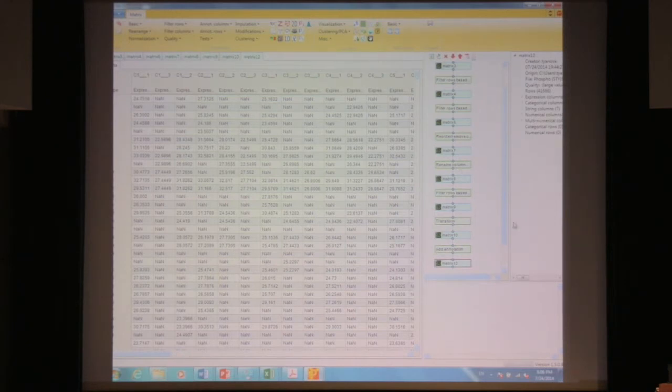Okay, that probably may not be finished on your laptops, but I'm going to do the next step and then I'll repeat it, because I want to get the next step started on my laptop here.